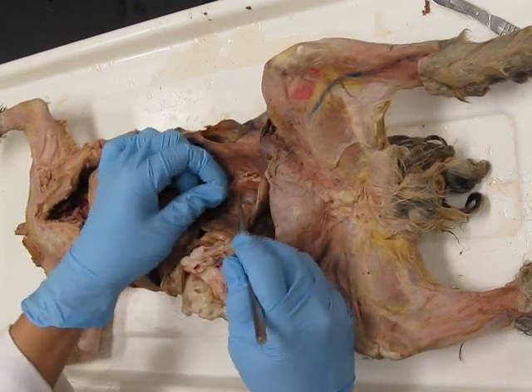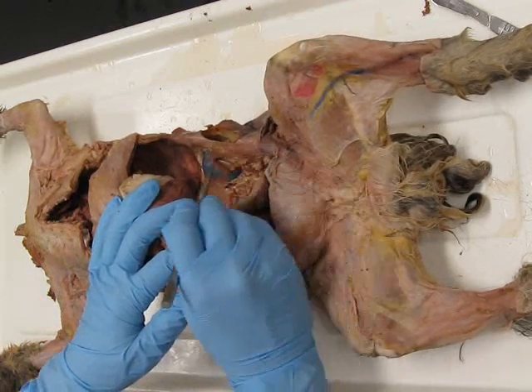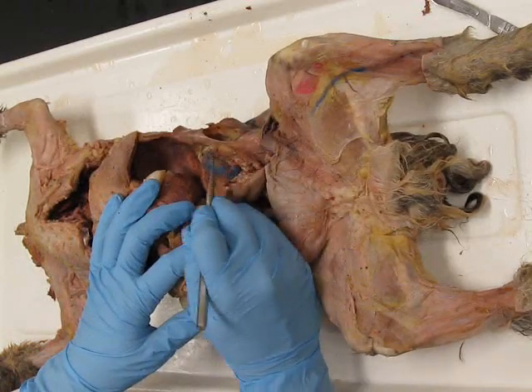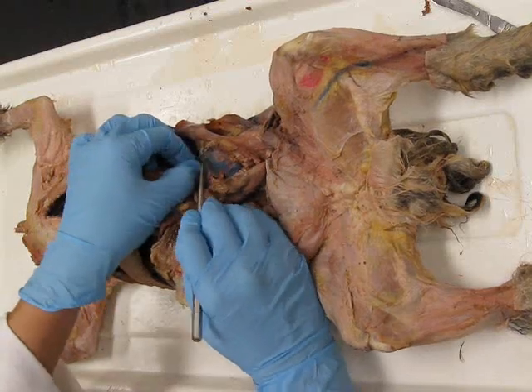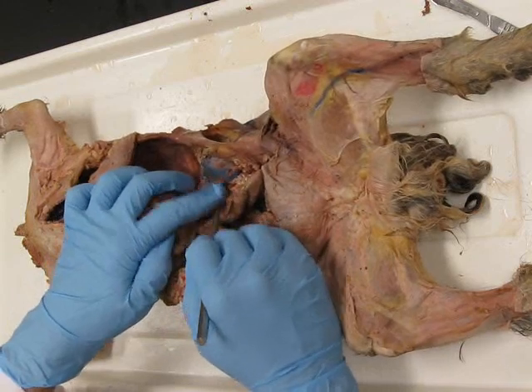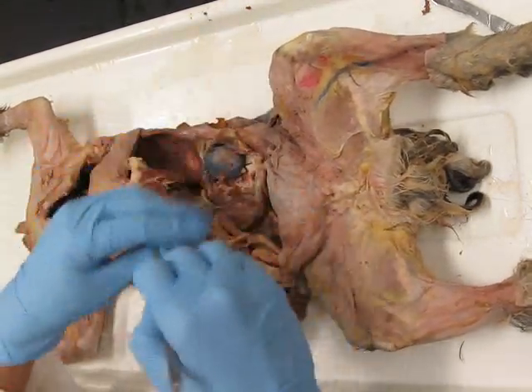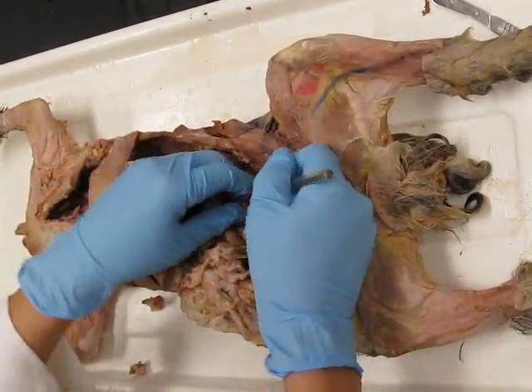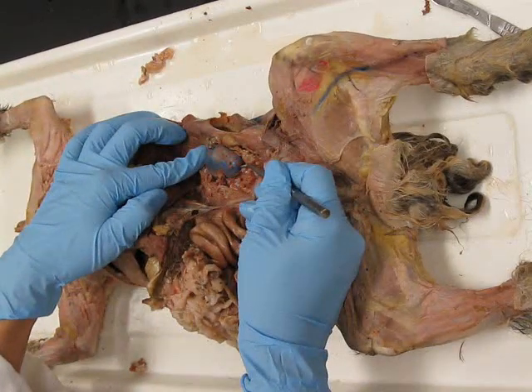See this membrane? Very thin. It's only single cell thick. Against that wall. And just use your probe to kind of unwrap the kidney. Your kidney may or may not be as blue. It's just from the paint that they inject and the blood supply traveling into the kidney. Try to just gently remove some of the fat back there. This is perirenal fat, protecting the kidney, providing fuel source. Like that, there's a kidney.